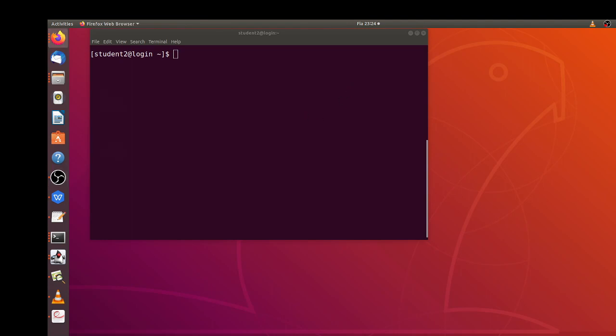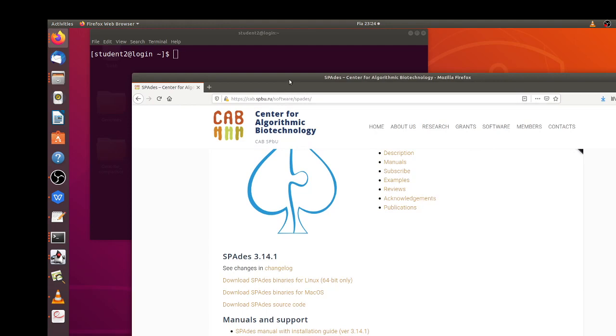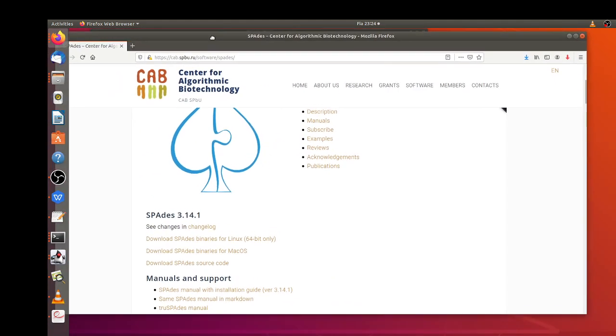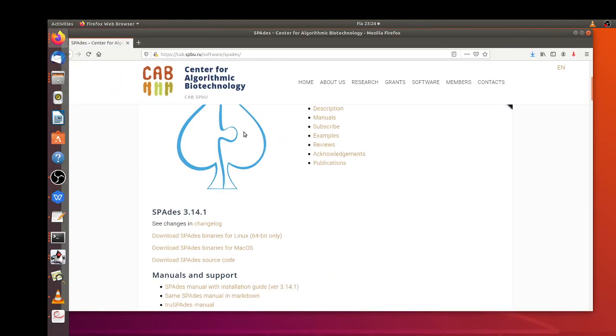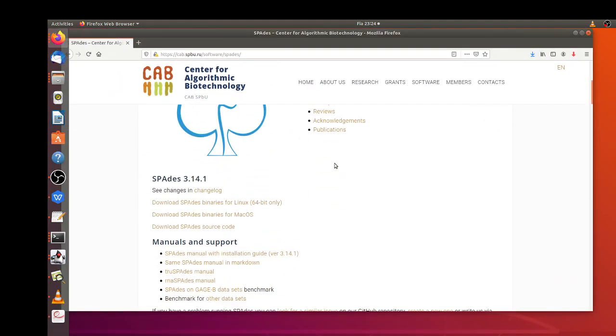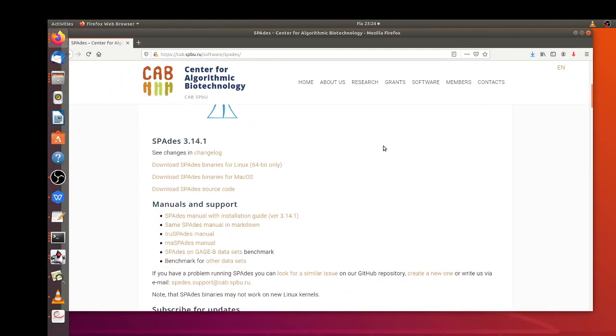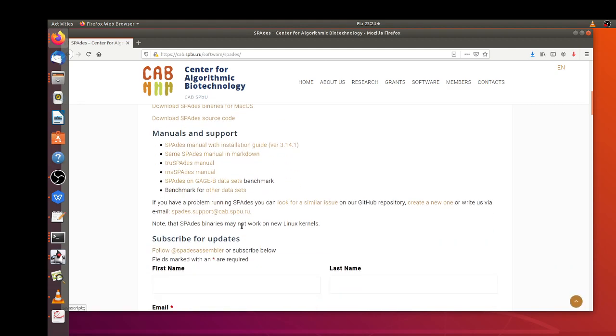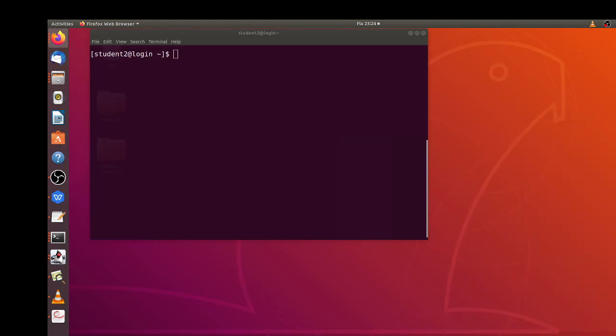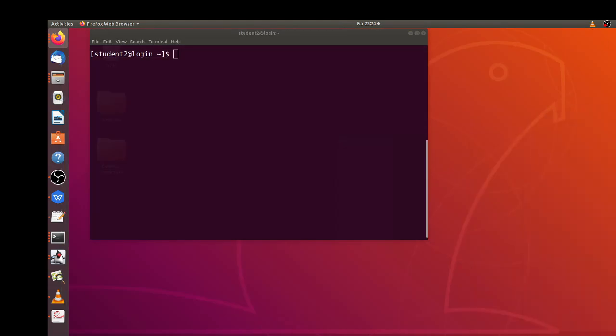SPAdes is a software that runs on Linux platform and this is the home page where you can download the software as well as the manual for running it.